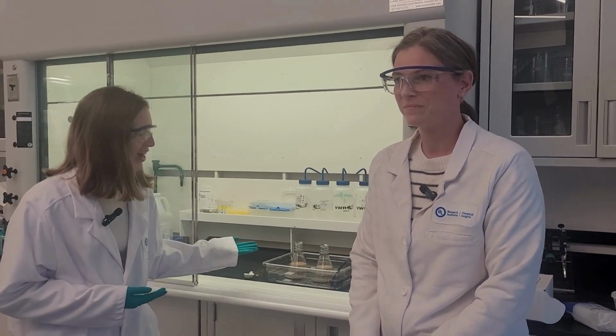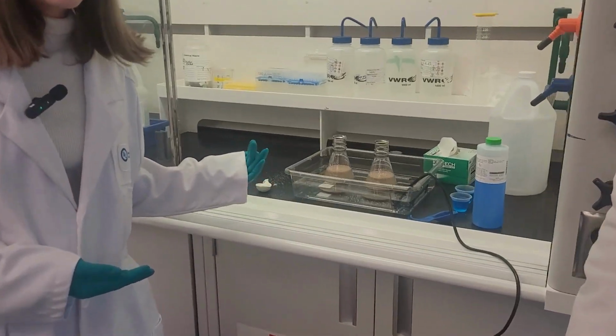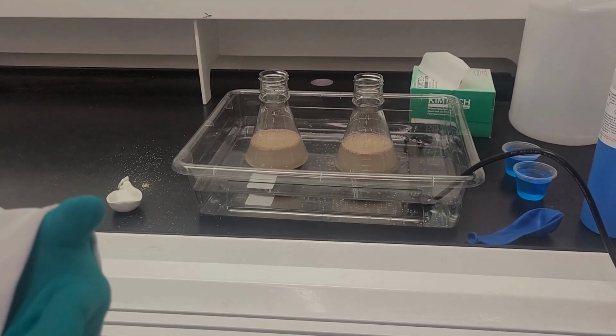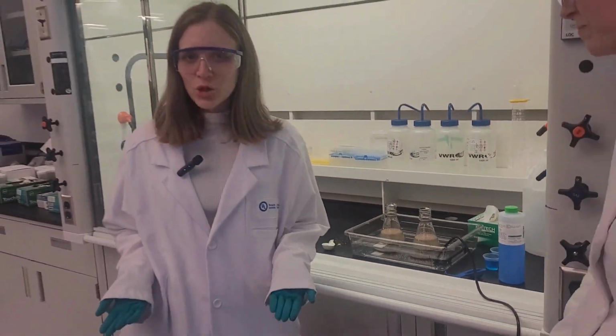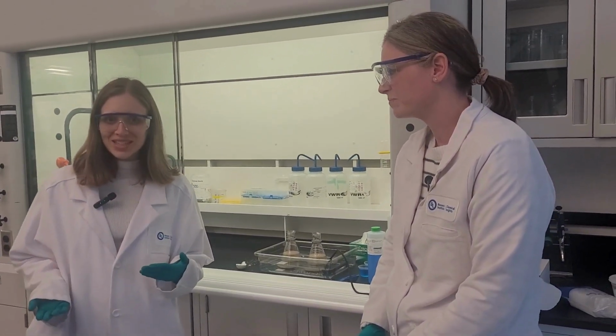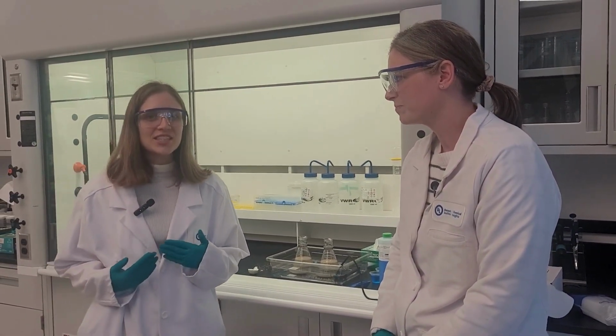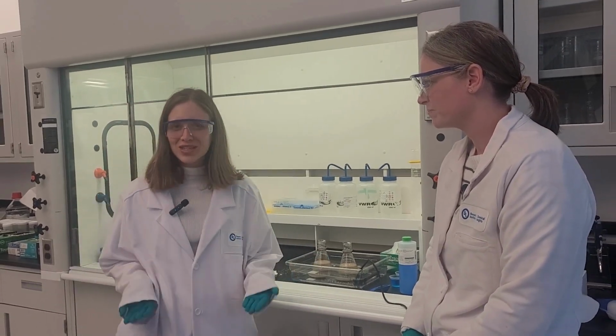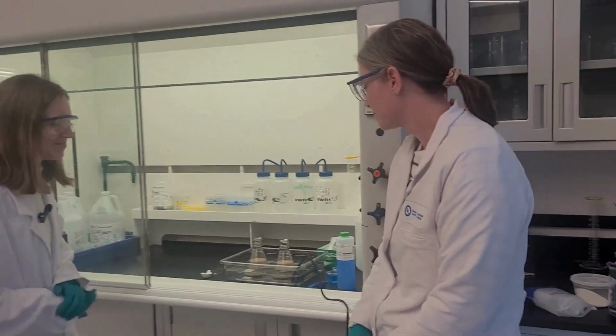So here we have two flasks. Each one contains yeast and a mix of sugar and water. The reason we're using yeast is because yeast cells are really similar to human cells, because both yeast and human cells undergo a process called cellular respiration, where they can use sugar, which is in the flasks, to produce energy. So what do you have, Emily?